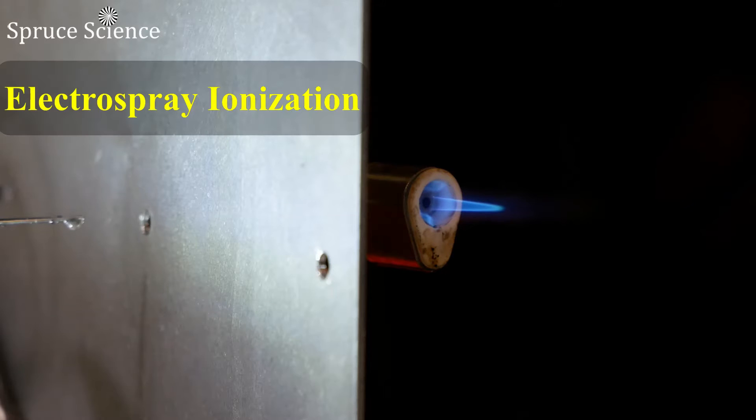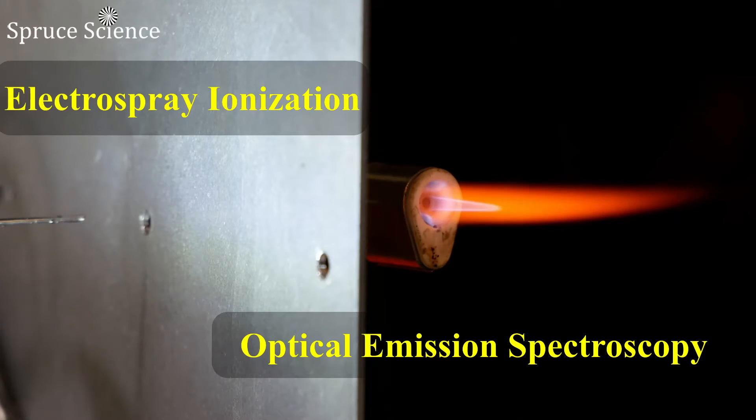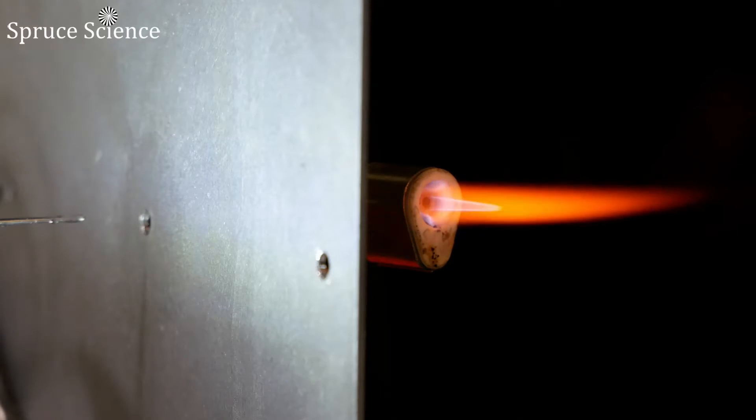The electrospray ionization coupled with optical emission spectroscopy is an analysis method that can be used to detect alkaline metals, for example.